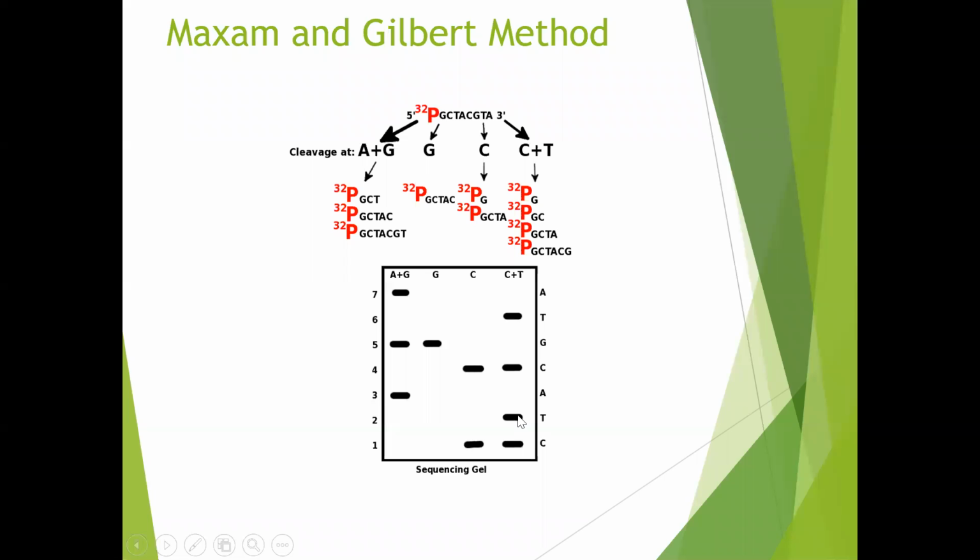If there is a band in C plus T, and there is no band in C, which means that it is T. It is terminated. The cleavage took place at T. That means it represents the T base.